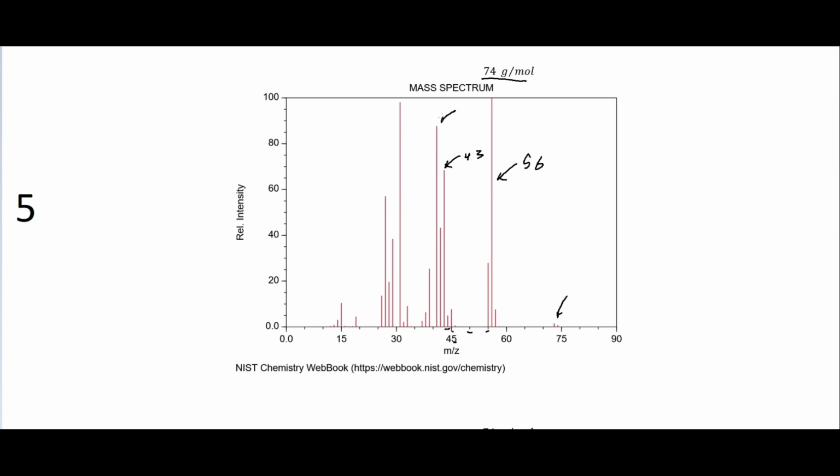We also have this here at 41, and so that is 2 less than our propyl group, and so that might tell us something. And then we have one here at 31. So we have another peak right there at 31. This one here is 29 and 27. So this is always a good thing to do right off the bat, is actually start just labeling what the actual peaks are and seeing if you have anything that looks like what it could possibly be.